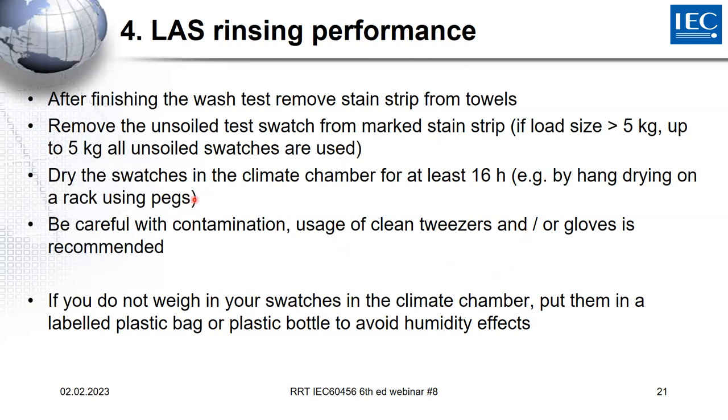The weighing of the swatches is recommended to be done in the climate chamber. A lot of labs don't have such a good scale in the climate chamber like we also have. For this, you can put the swatches for each test in a labeled plastic bag or a plastic bottle. It's just to avoid humidity effects.